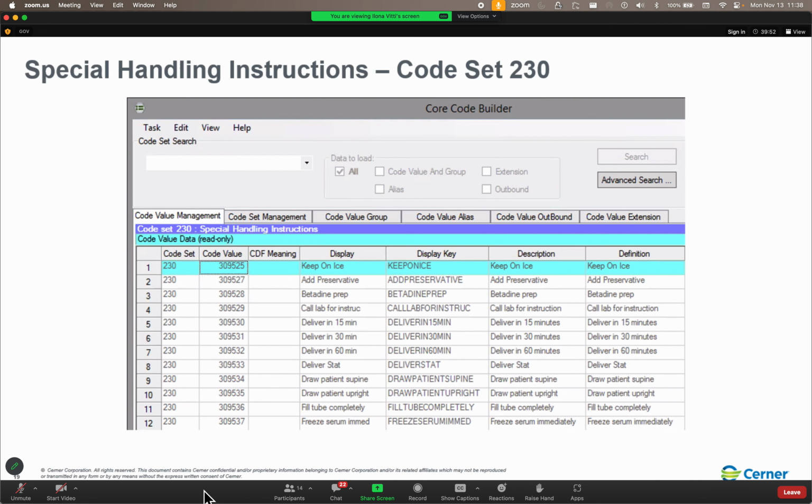Each of us is going to have our assigned orderable. Each of us is going to select our assigned orderable here. And assuming I selected correctly, under the collection requirements, all of our orders should be routing to the chemistry manual bench. Our orders may have different containers, that's fine. But all of our orders should be routing to the chemistry manual bench.